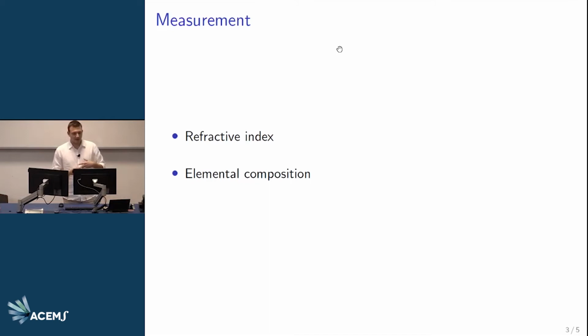This is measurement of elemental concentrations of about 20 different elements. In Australia, we measure this using laser ablation inductively coupled plasma mass spectrometry, or LA-ICPMS, where the samples are basically vaporized, then ionized, and the ionized sample then has its elemental concentrations measured with a mass spectrometer.